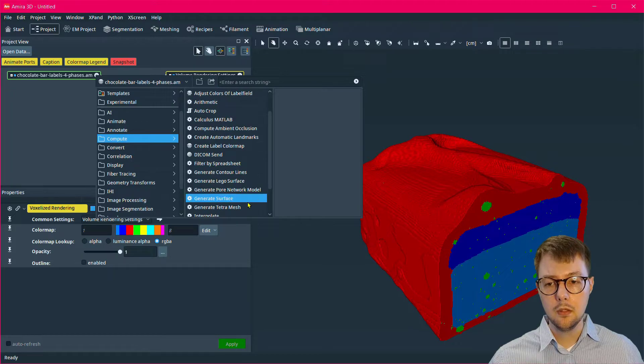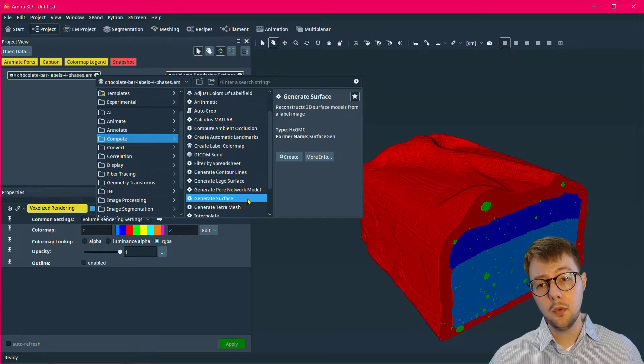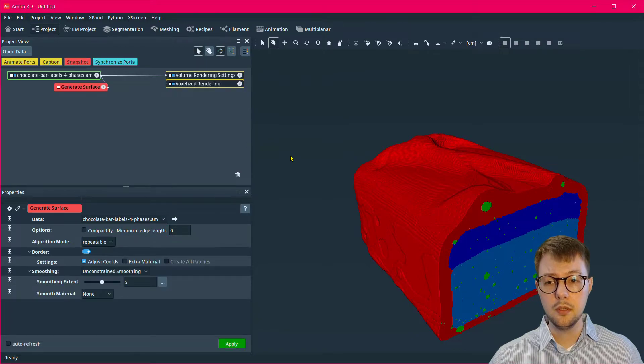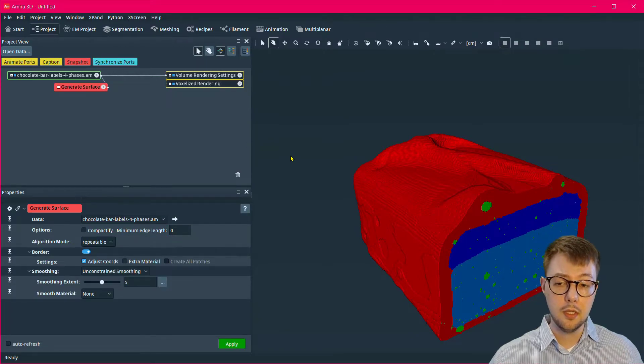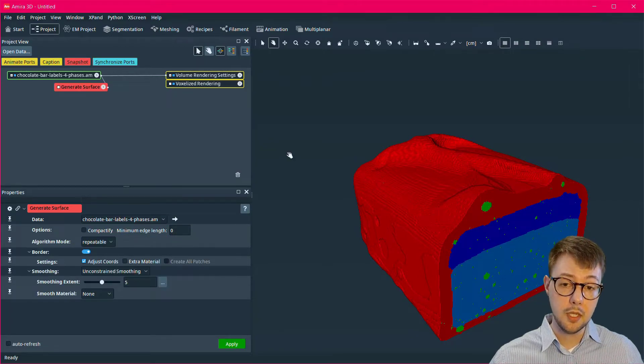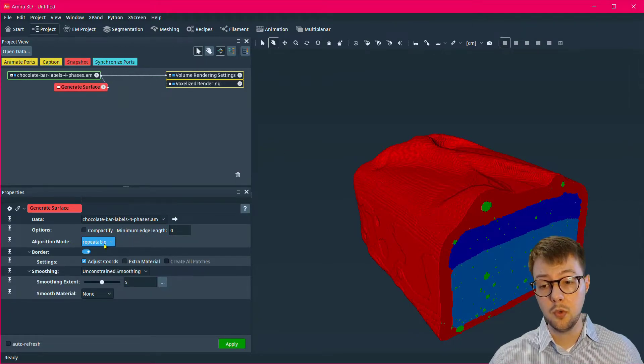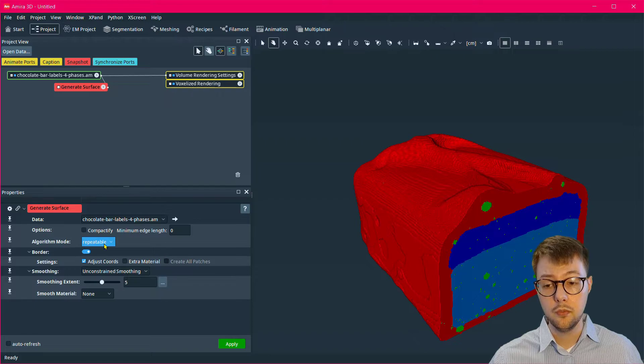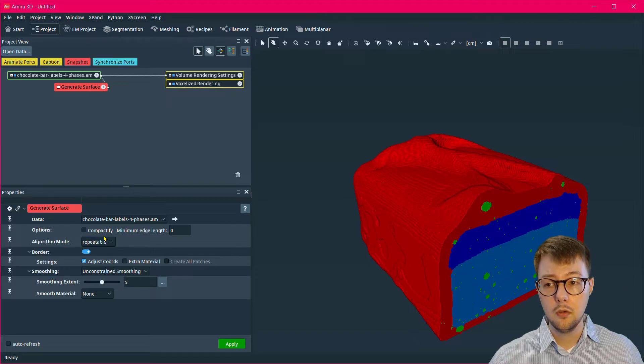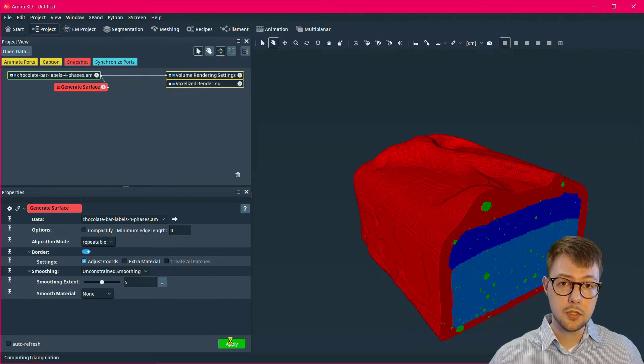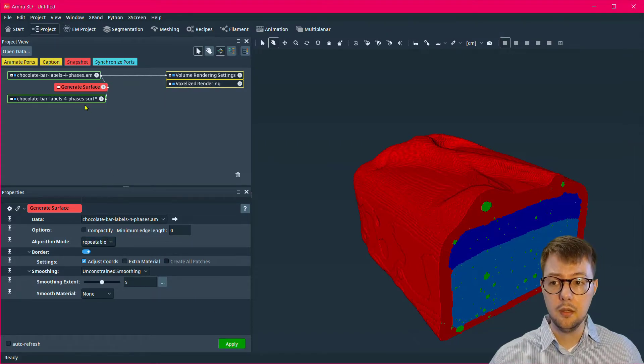This module has many parameters and these will affect the surface area measurement. It's recommended that you read the documentation so that you better understand what these parameters do. For now, I'll use the default options and select apply.